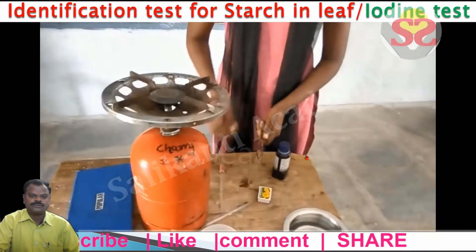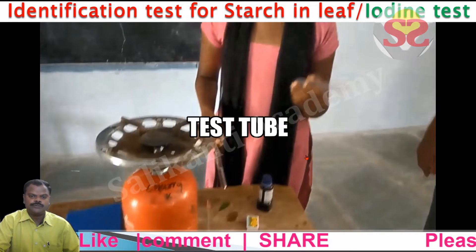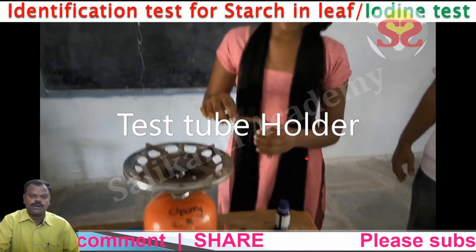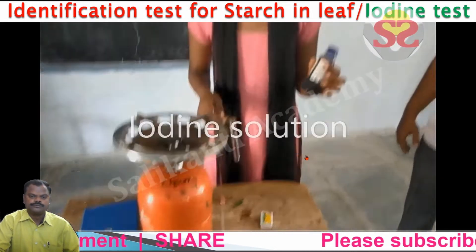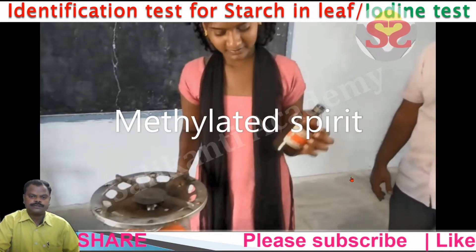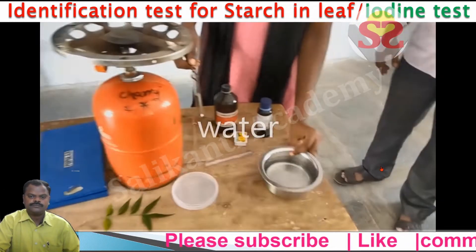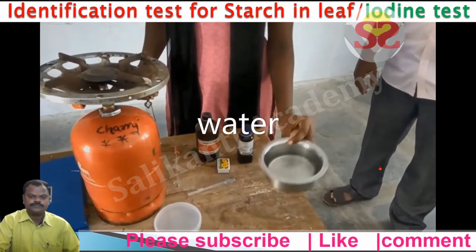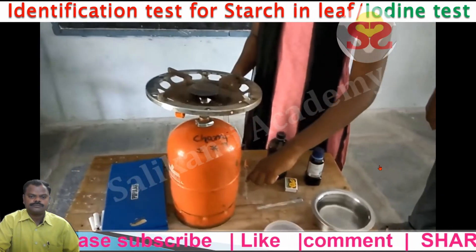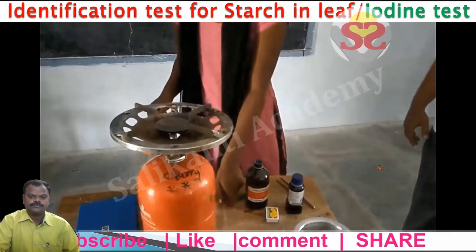For this test, we require a leaf, protective gear, a petri dish, iodine solution, methylated spirit, a gas burner, a pipe, water, a beaker, forceps, and a dropper.